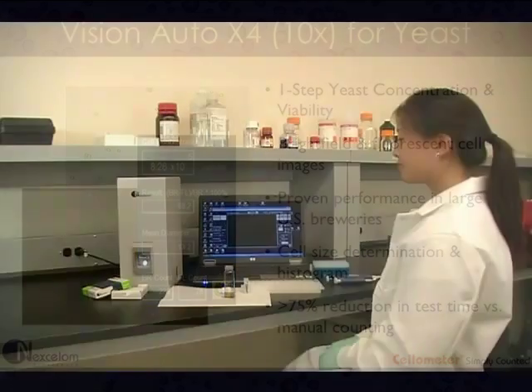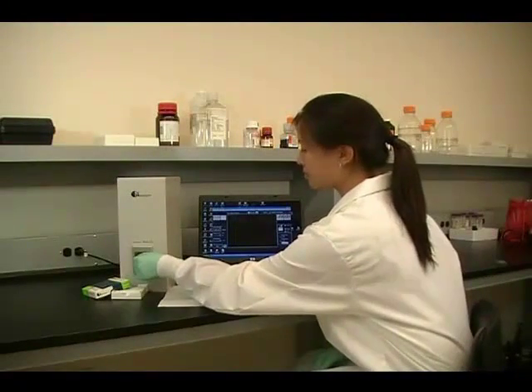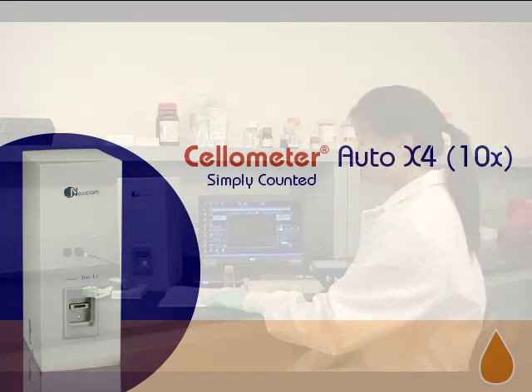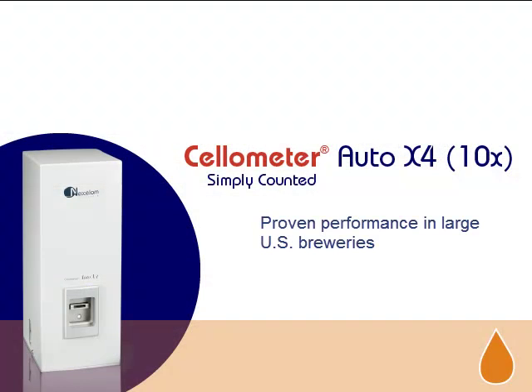No washing or instrument setup is required. The Auto X4-10X offers proven performance in a variety of research and industry settings, including the largest U.S. breweries.